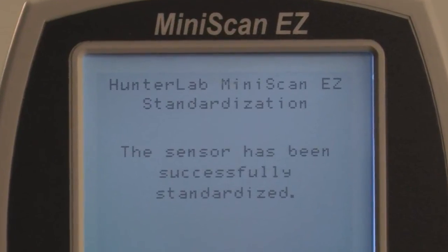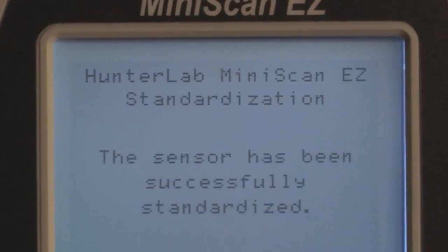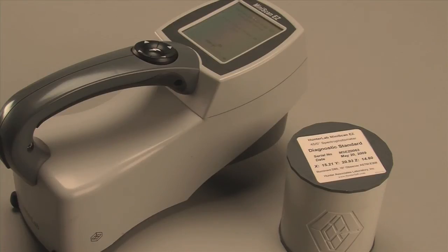The menu screen will indicate that the instrument has been successfully standardized. You have now set the lower and upper limits of scale and are ready to accurately measure products.